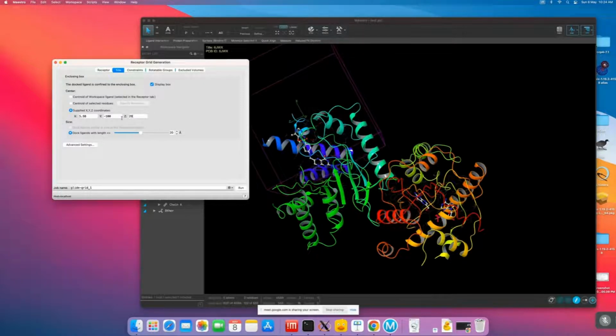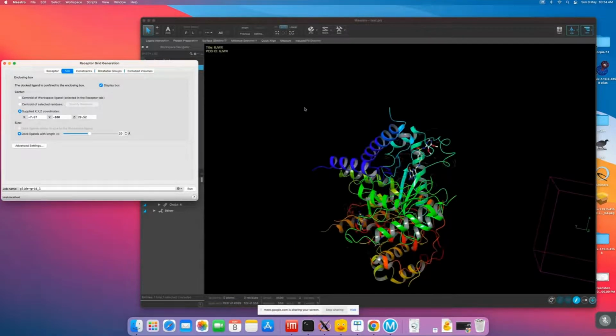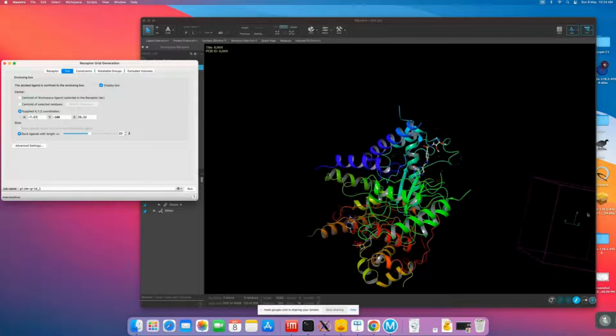You can change the numbers and you can fit this particular enzyme in this box. You need to take like this, and you can change this as well. 1.58, minus 78, 7.567. Okay. So this is going outside right now. You need to shift this particular box and fit this enzyme in the box. You need to check all the XYZ coordinates and play with it.